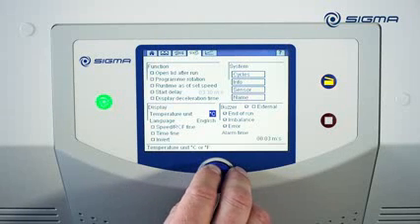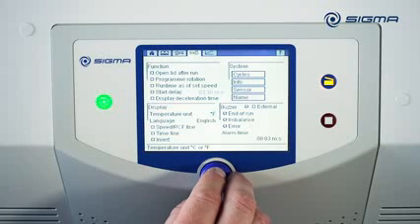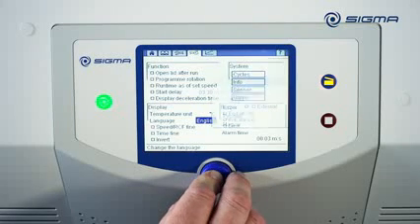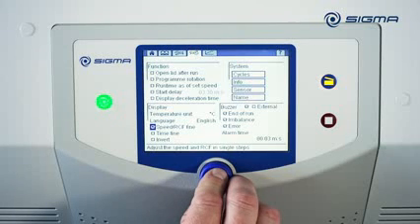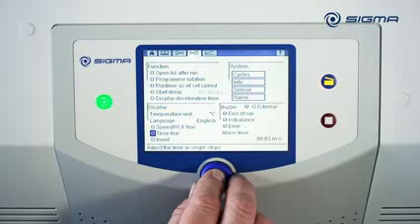The centrifuge temperature can optionally be displayed in degrees Celsius or degrees Fahrenheit. Many different languages can be selected under Language. If the Speed RCF Fine option is enabled, values can be set using small step intervals. The Runtime can similarly be set with small steps.